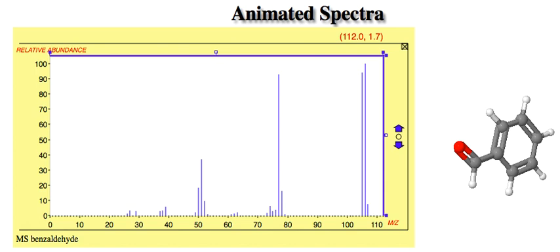Chlorine with the 3-to-1 mass ratio parent peak, subtracting off 35 and 37 from the 2 peaks to get a strong peak, that's pretty indicative. Nitrogen having an odd molecular mass peak. Now, it's also possible, of course, to have 2 nitrogens, then it would be even again. And it's also possible to have 2 chlorines or 2 bromines, and those things do get a little bit more complicated.